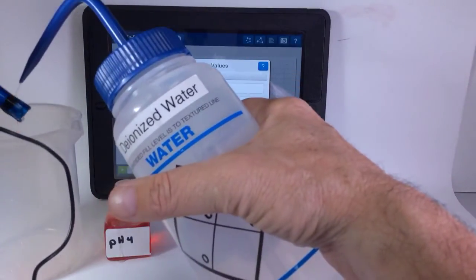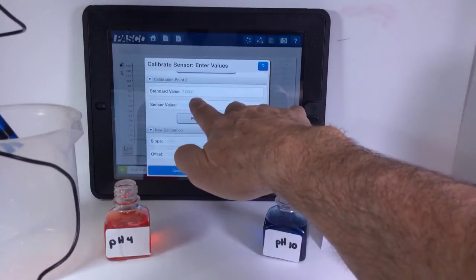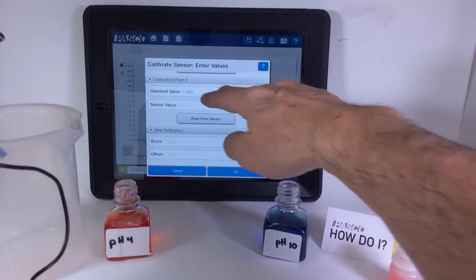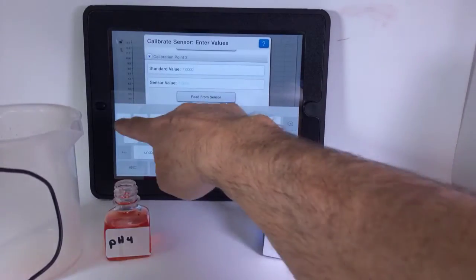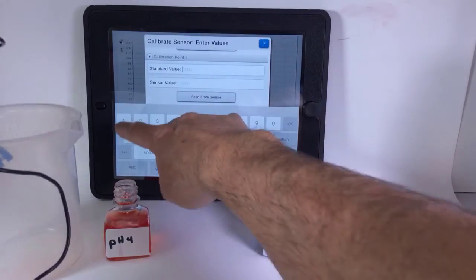Take it out. I'm going to rinse it off. Scroll down on the list. But this time it says the value is a 7 and I have a pH of 10, so I'm going to change that to a 10.